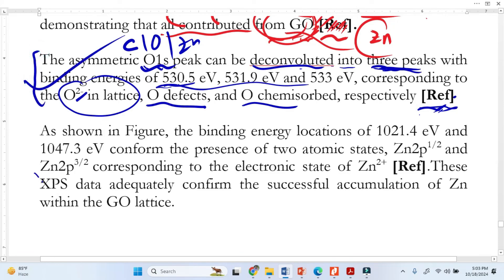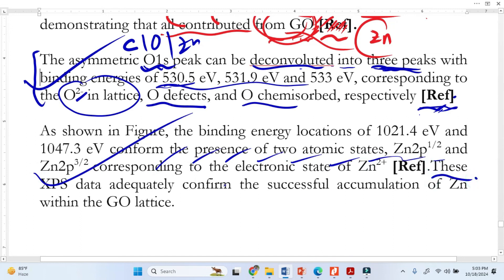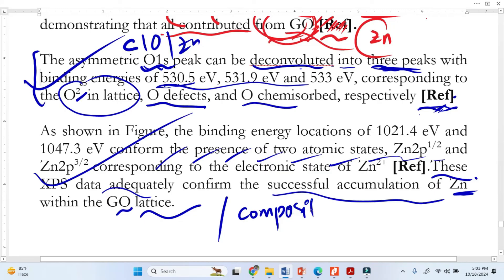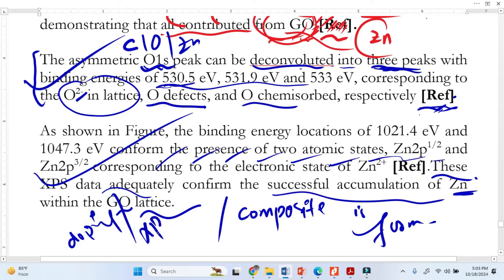Similarly, we explain the zinc 2p peak with the same approach. Finally, we summarize: 'These data adequately confirm the successful incorporation of zinc within the graphene oxide lattice' — meaning the composite is already formed. This is a very interesting interpretation technique using XPS.